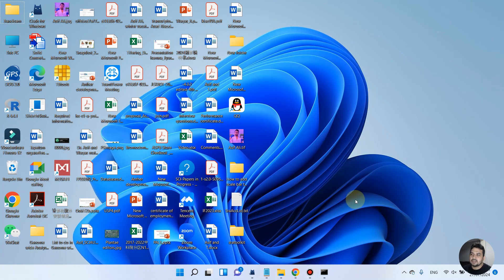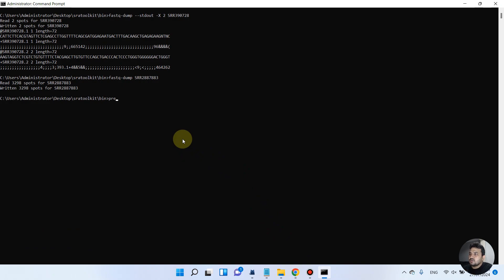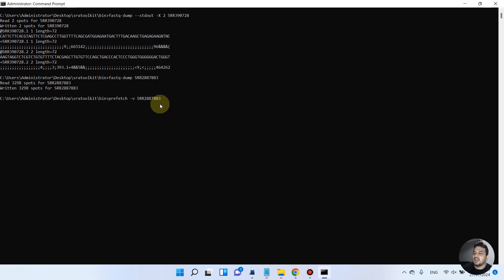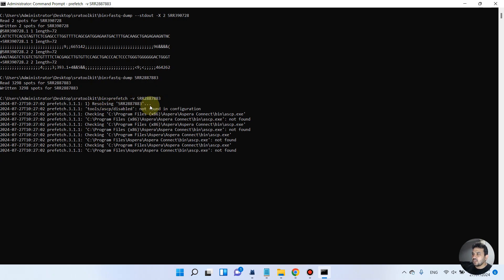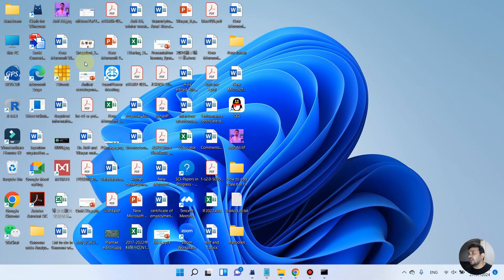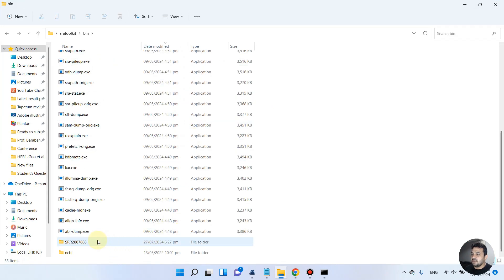Going back to the command prompt, we can use the second option: 'prefetch -vv' followed by the SRA accession ID, then press enter. It gives some messages and shows it is now downloading via HTTPS. Once the download is finished it will appear in the bin folder.